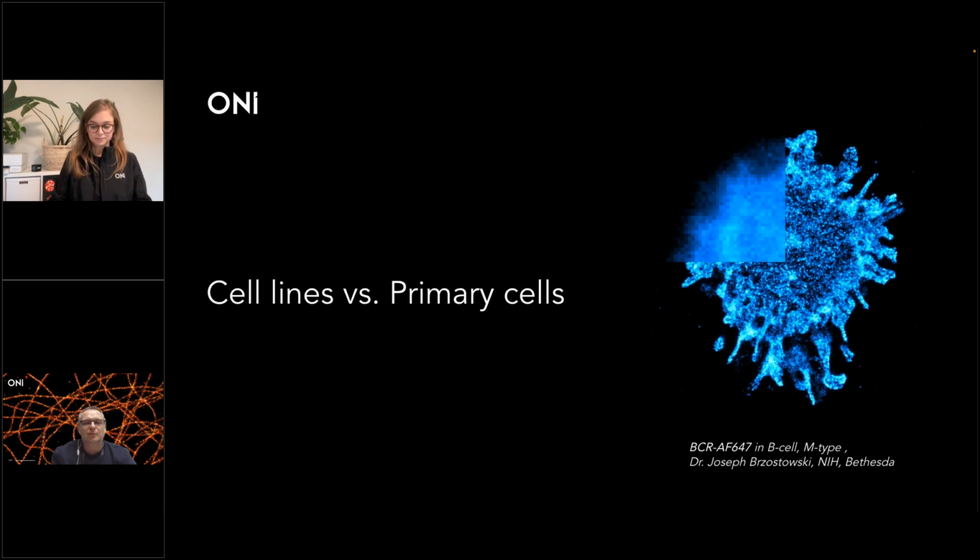I will later cover a little bit about what the best strategies to use are. But overall, from a labeling point of view, if you are already performing fluorescent imaging using confocal microscopy, you can freely use the same labeling strategies for single molecule localization microscopy. What you need to pay attention to is the selection of fluorescent dyes.